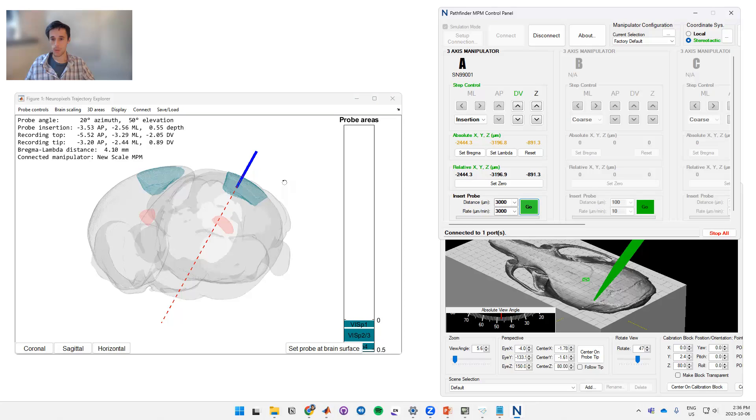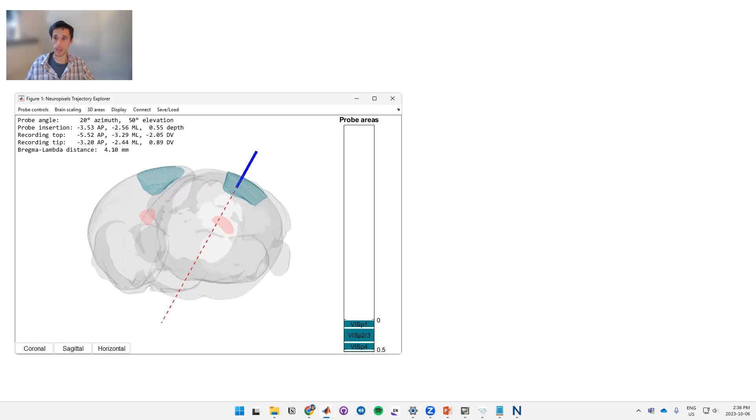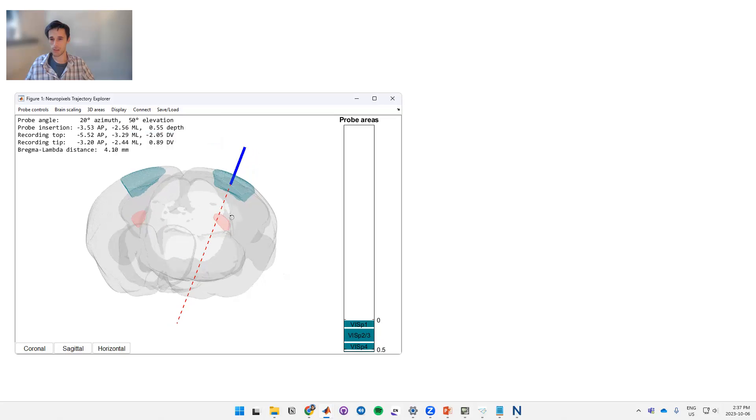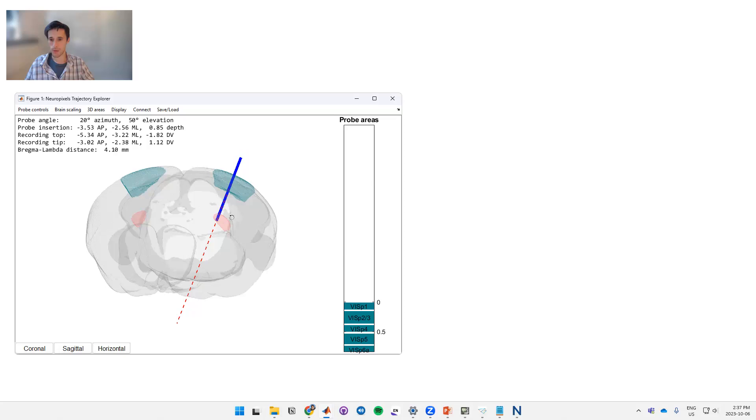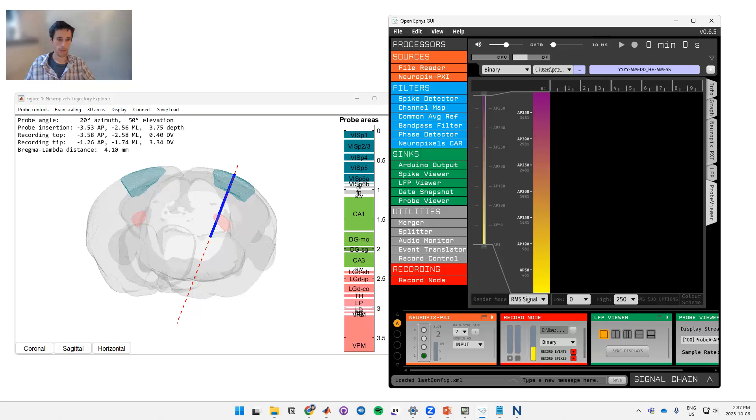Now once we're in the brain, if we want to compare our areas that we're looking for to our recordings, then we can also connect these to recording software. So if you go to recording software here we have two options, both OpenEphys and SpikeGLX. To get some more areas let's just move our probe deeper into the brain. Alright, so in OpenEphys your recording will look something like this.